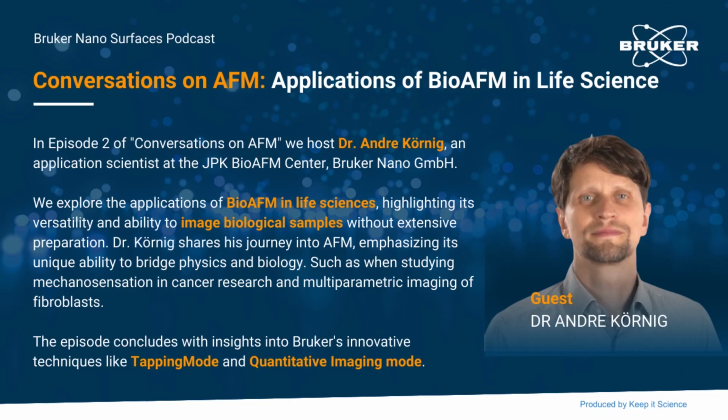So, I'm coming from the JPK world, and I've been using this mode a long time. It's the easiest, as I said before, and a very powerful mode. So you get a lot of information out of it. You don't have to set it up so much, and it's for any sample prep that you don't know whether it works well. If you can't measure it with the QI mode, probably other modes will be very difficult, because there you often push things around more, or the interaction is too strong or too soft and so on. So I'm using it for, let's say, every sample that I can find.